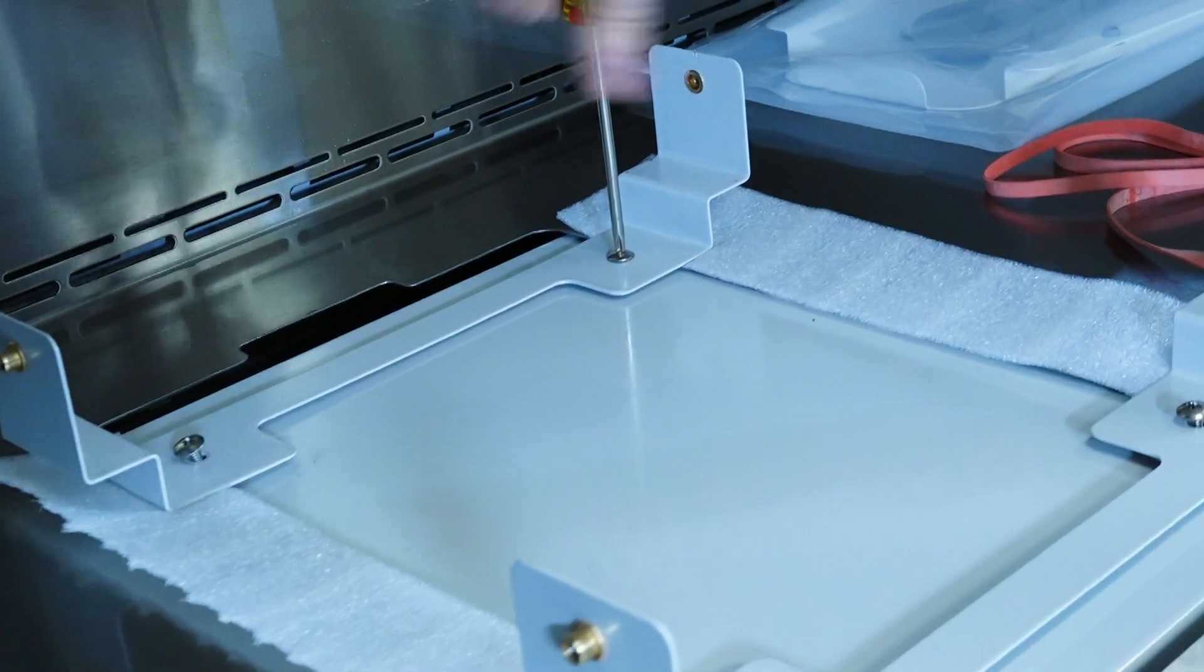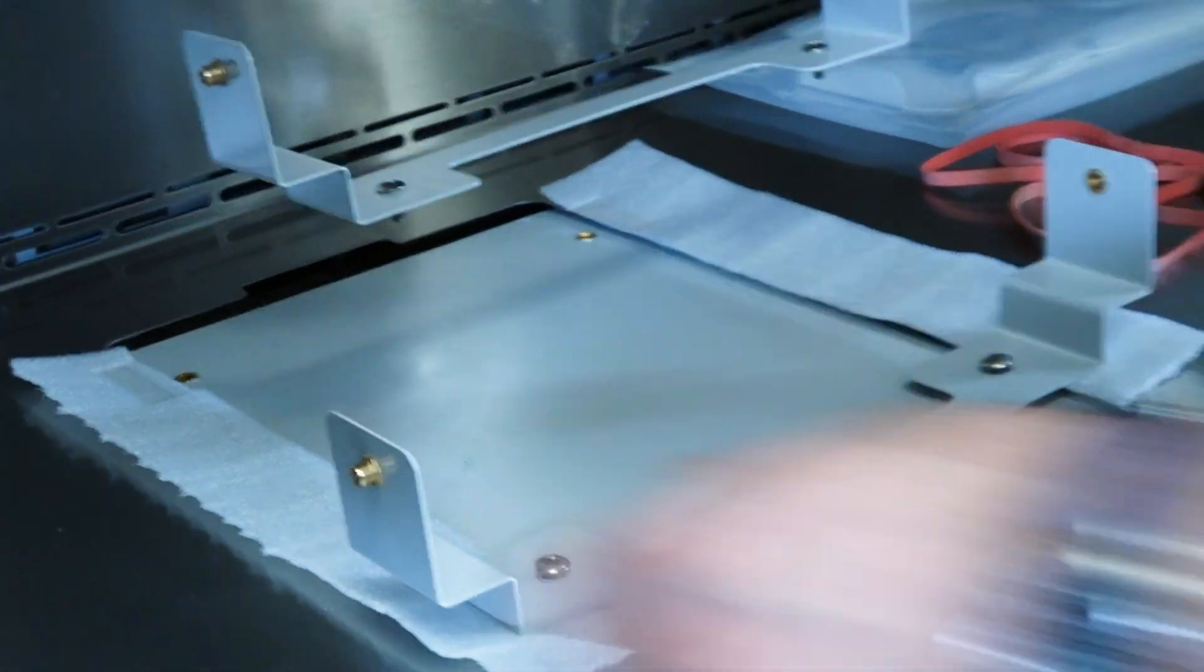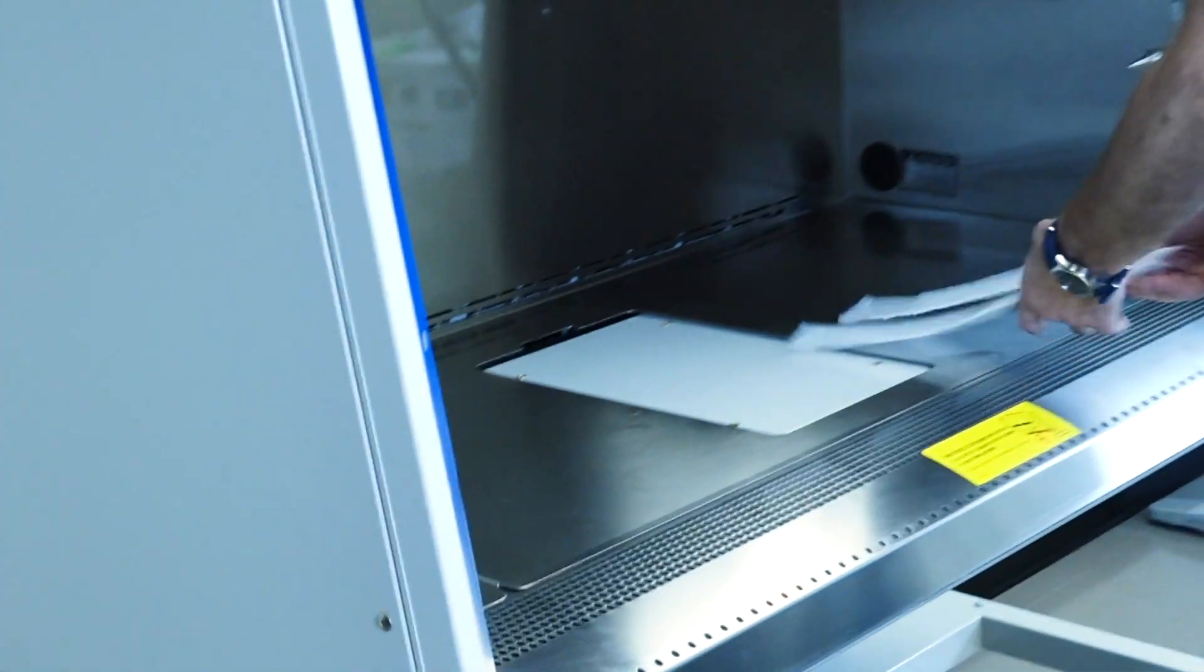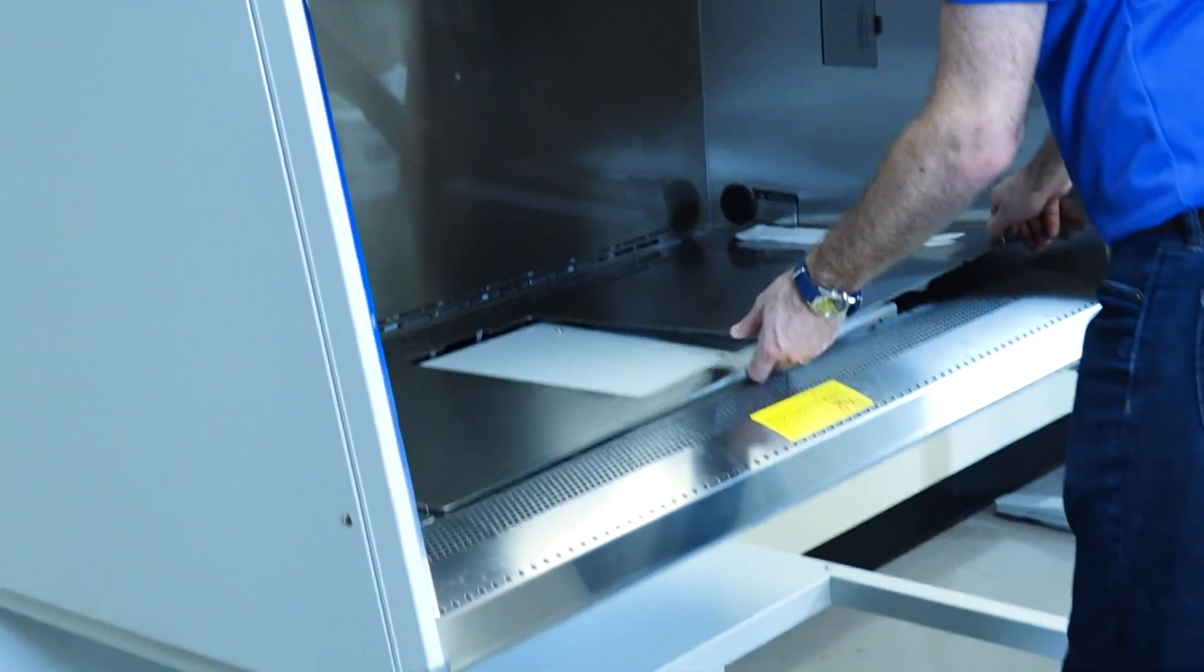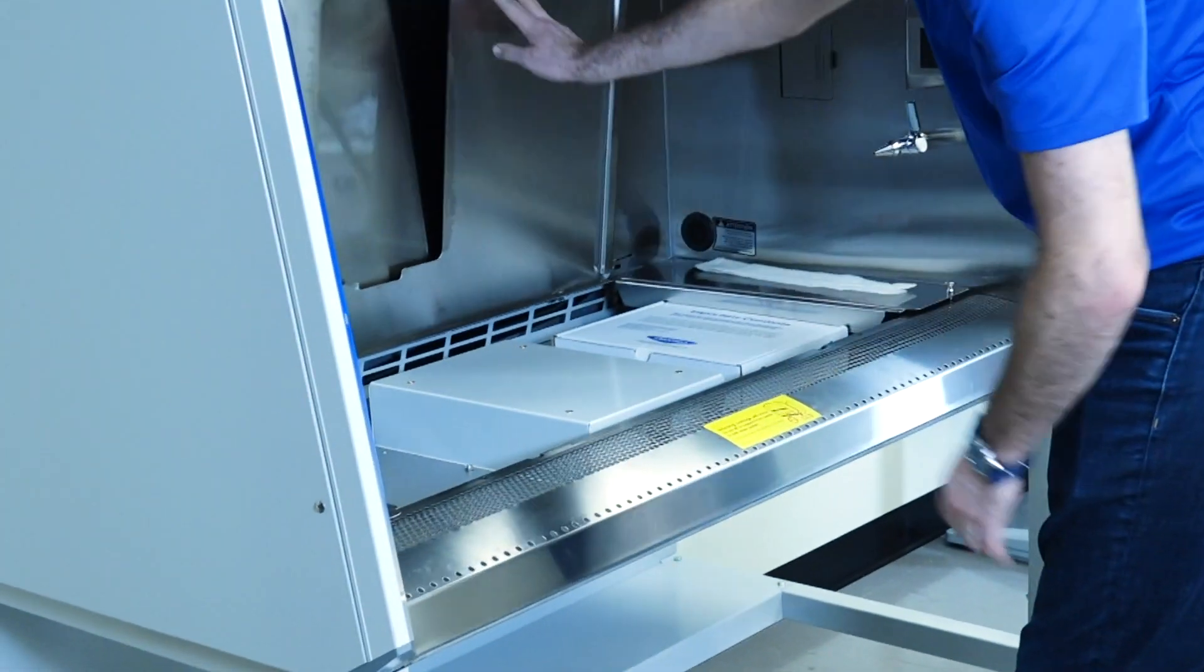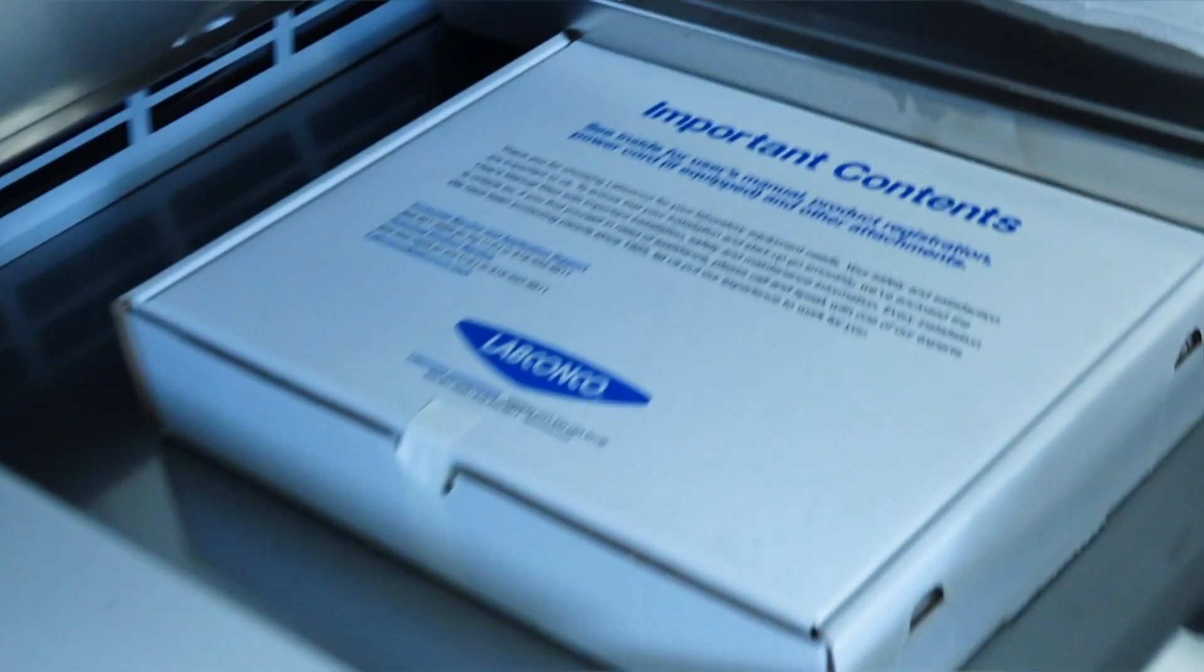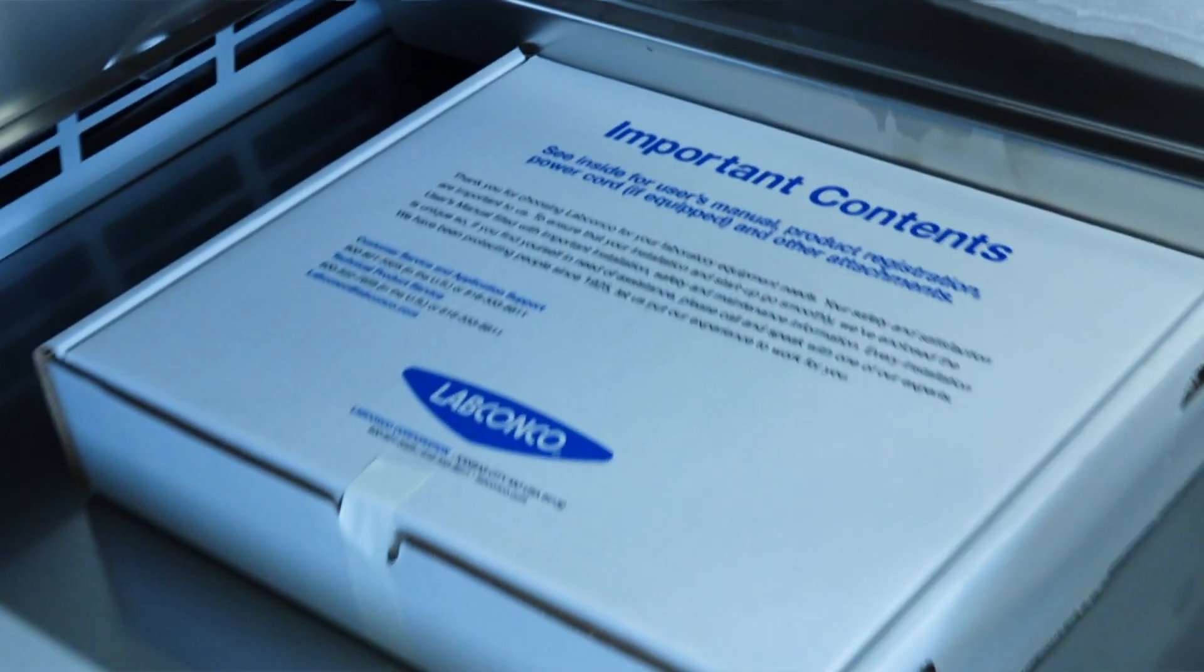These screws can be discarded along with the two shipping brackets they were attached to. Next, lift the work surface and remove the BSC parts box. Check the box to ensure all contents are present.